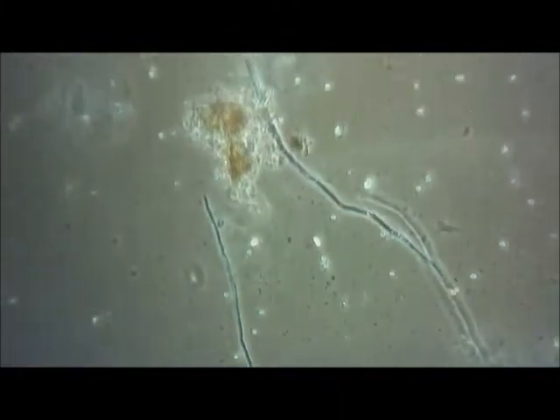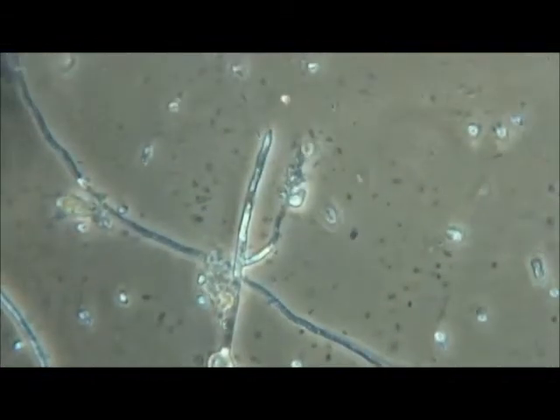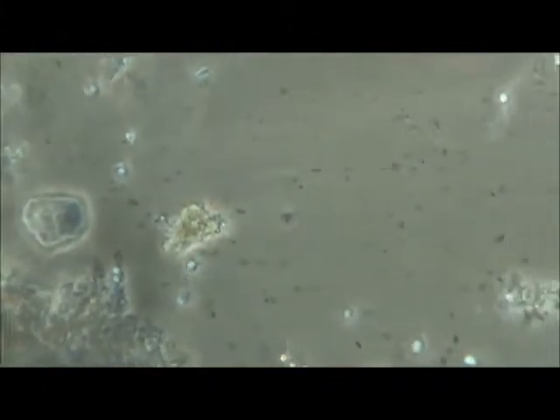Plenty of flagellates and at least 2 or 3 different species. And here's a closer look. Now you can see that there's actually a number of different types of flagellates, and that's part of what we talk about with diversity.